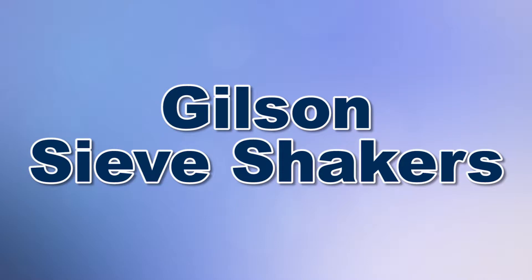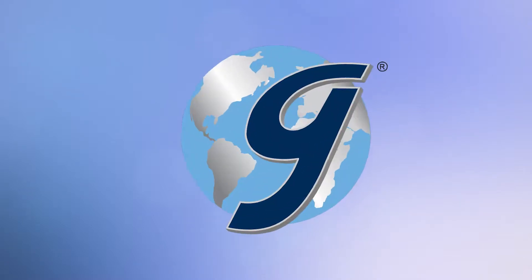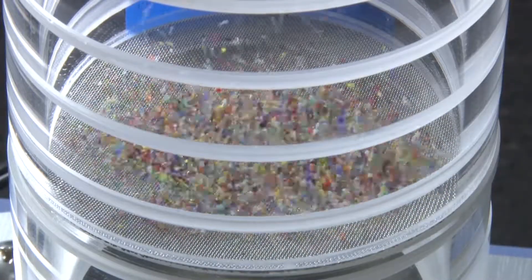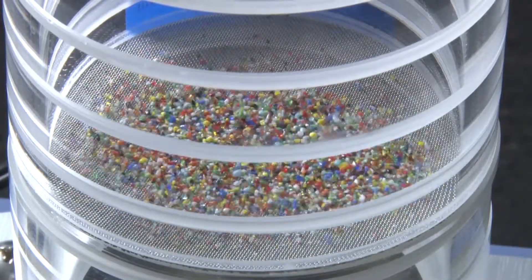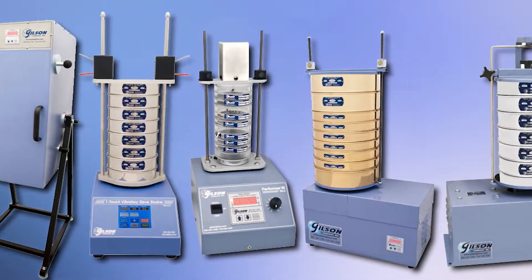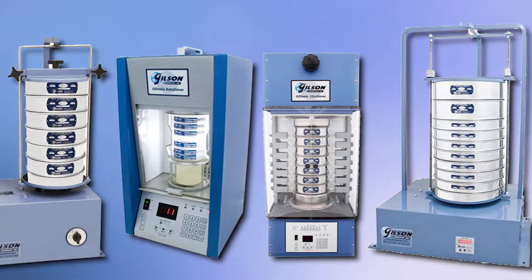When you need to accurately perform particle sizing operations, Gilson is your best choice. Gilson has everything you need to perform any sieving test, ensuring that your sieving tests are compliant with ASTM, AASHTO, and other testing specifications. And Gilson's world-class sieve shakers are built for sizing particles from large coarse aggregates to fine powders.